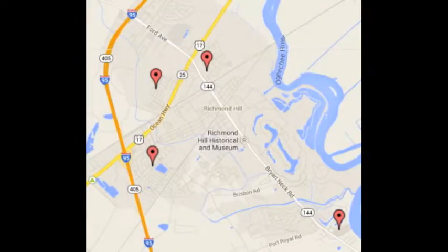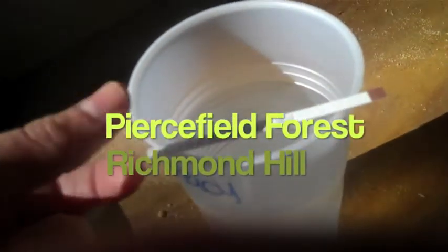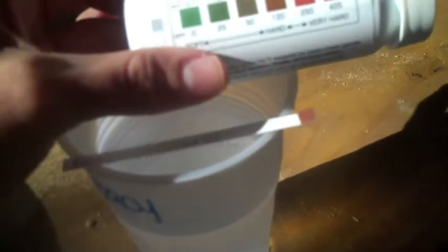After the Hinesville area, we are moving into Richmond Hill. For 1 second, shake off the excess, lay flat. Are you on Richmond Hill City Water? Yes. Okay, that makes sense. The city waters so far have been that number 7, 120 ppm hard. So that looks like what it is to me. Unless it's 15. Do you think it's... Yup. It's very hard.